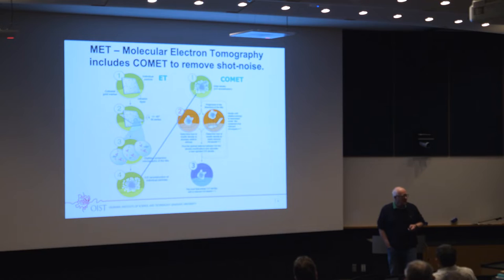It's just that the maximum information in any picture you have is when two pixels never correlate. That means you need to describe every pixel. That's a lot of information. So because noise is of that order, it will always have more information in the noise than in the actual picture. So you remove noise, and then you cycle this, and voila, you get down, and I will show you later, we get down to 1 nanometer now.